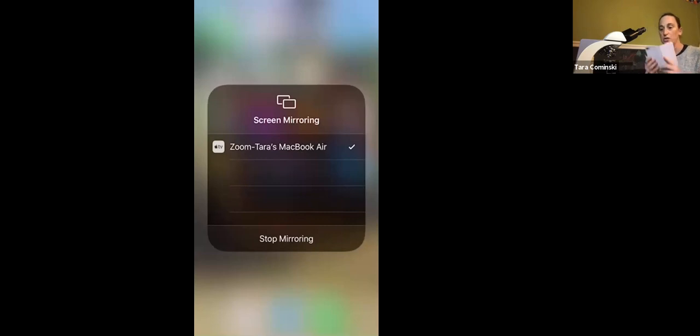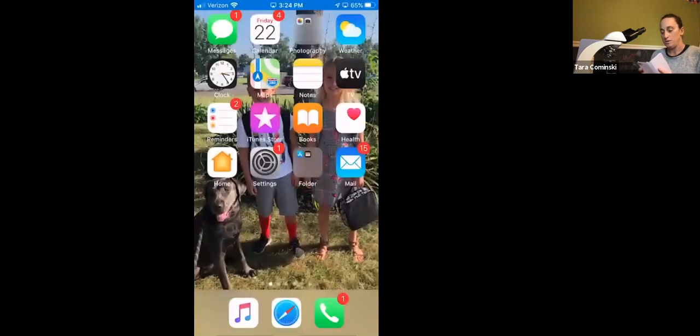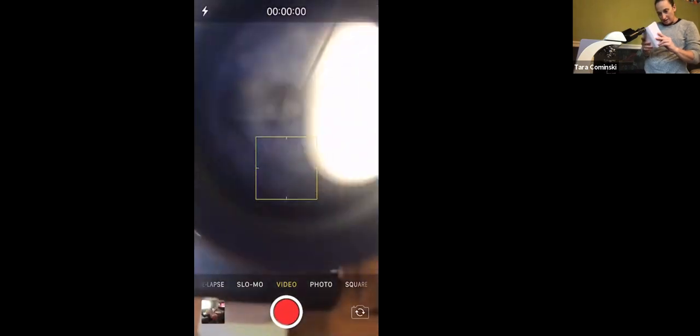So what I'm going to do now is show you what I see in the microscope. Just so you know, this is really the only way of doing this. I've got to stand up for that. Okay, I'm going to flash it for 1 second, so you guys can see what I see. You see that letter E that's upside down? It's a little blurry, all right?